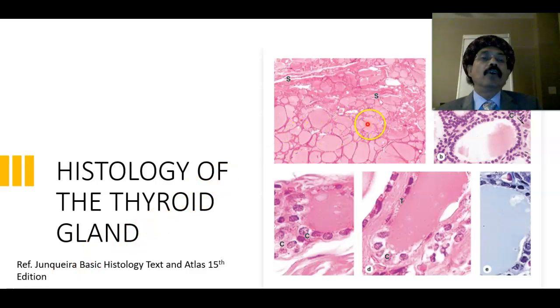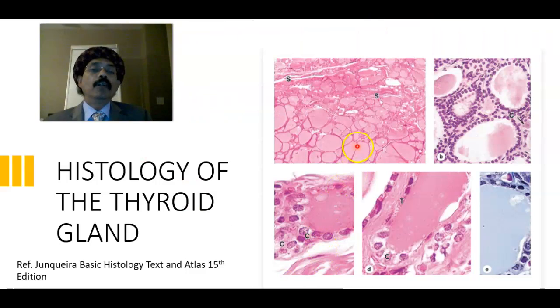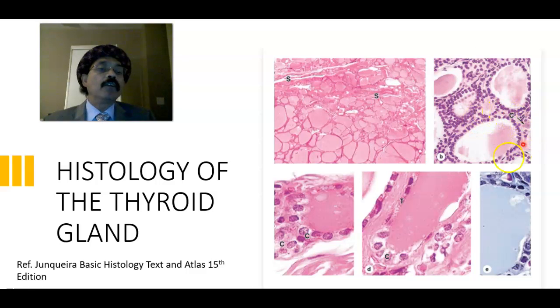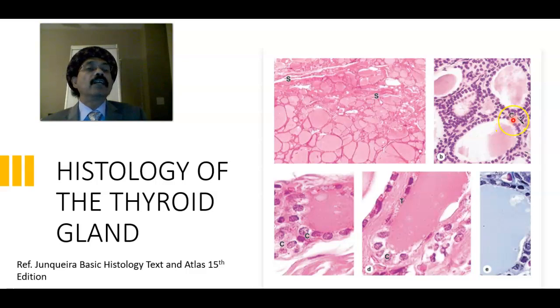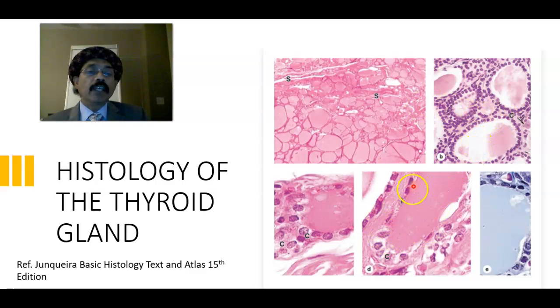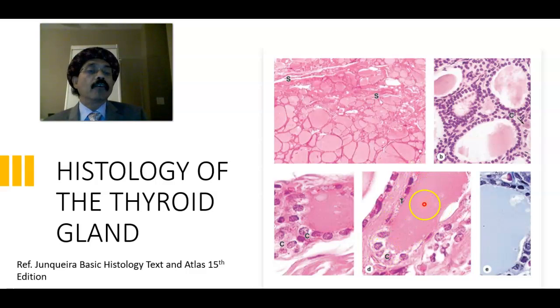In this section of the thyroid gland we see multiple follicles lined by simple cuboidal epithelium. Septa coming from the capsule of the thyroid gland are visible. We may see clear cells or parafollicular cells between the follicles. The follicular cells are also called thyrocytes or thyroid follicular cells, and the colloid inside is rich in thyroglobulin.